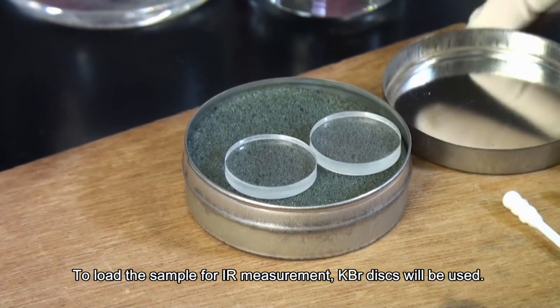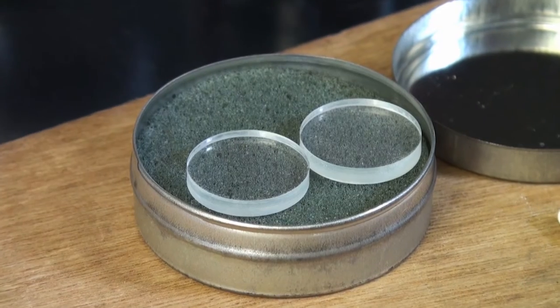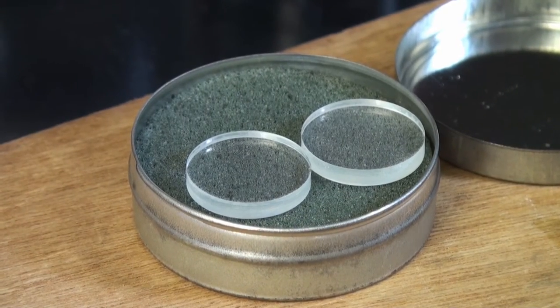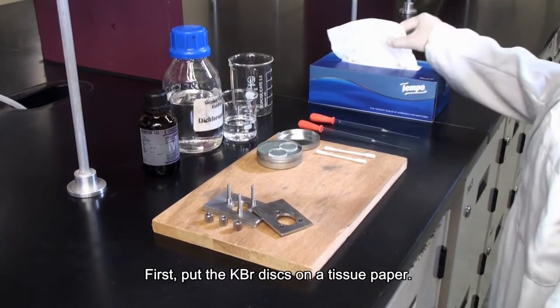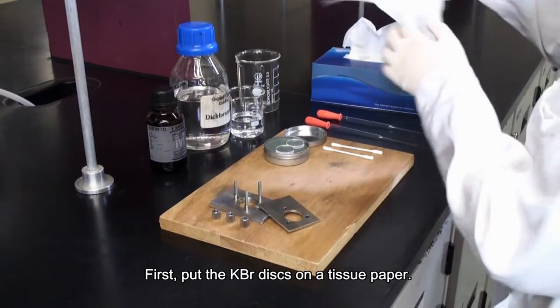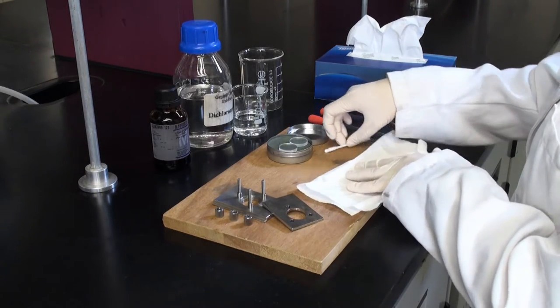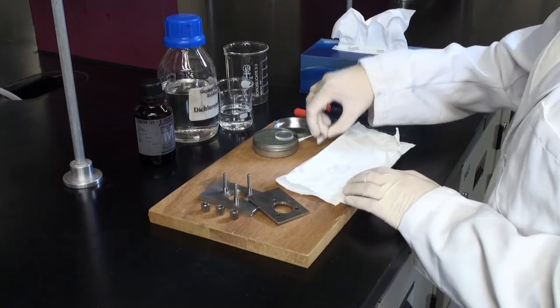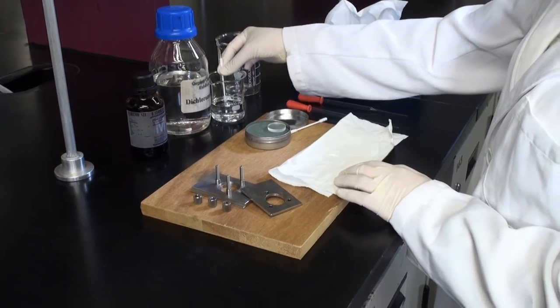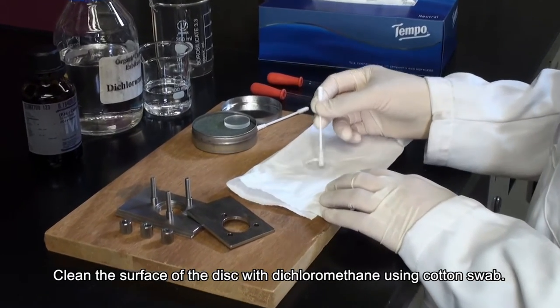To load the sample for IR measurement, KBr disks will be used. First, put the KBr disks on a tissue paper. Clean the surface of the disks with dichloromethane using a cotton swab.